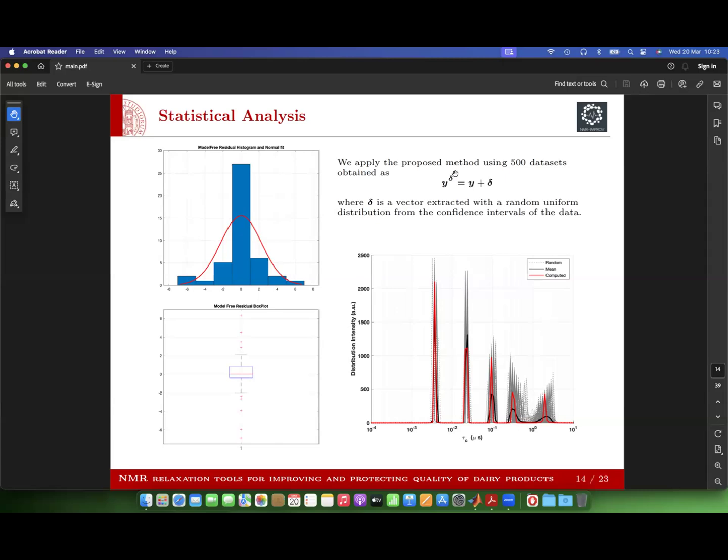I was wondering, if we think about this relaxation enhancement caused by cross relaxation or the paramagnetic relaxation enhancement, which are at least two cases where the relaxation rate increases in certain frequency ranges with respect to an otherwise regular background curve, I would say that probably the background curve could be explained most of the time by a sum of Lorentzians, and only this. Areas of enhanced relaxation would have to be obtained or calculated or estimated, not using this distribution of Lorentzian curves.